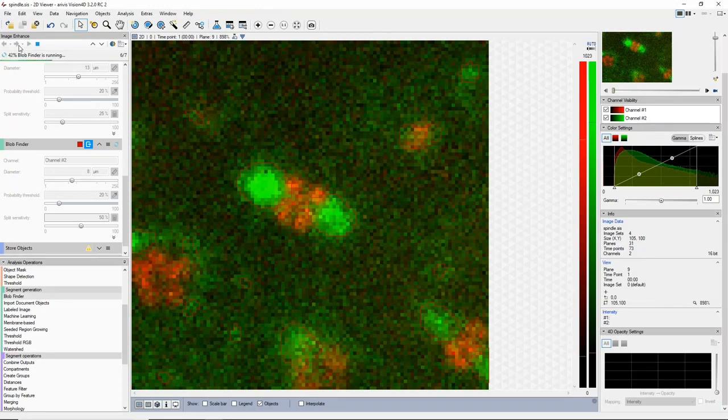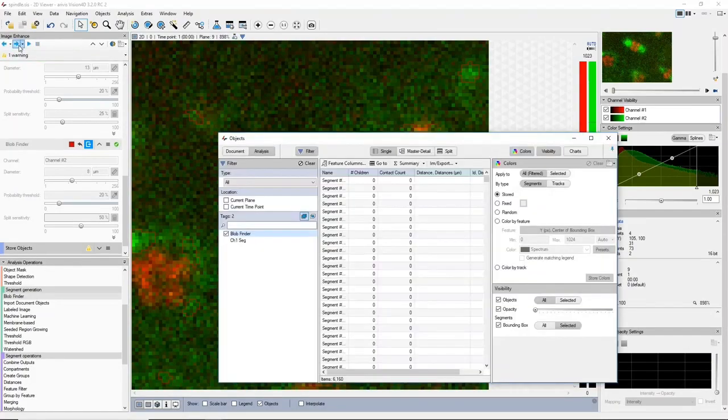So with the distance operation, if any of you have used it before, you'll know that it works by essentially measuring the distance between so-called reference objects and subjects. And so you can use it purely as a distance measurement operation. You can also use it as a filter to identify only objects within a certain distance range.